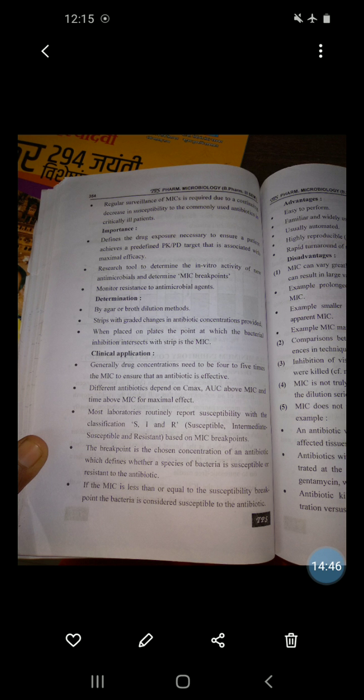Then a strip with graded changes in antibiotic concentration is provided. When placed on a plate, the point at which the bacterial inhibition intersects with the strip is the MIC, that is, the minimum inhibitory concentration.